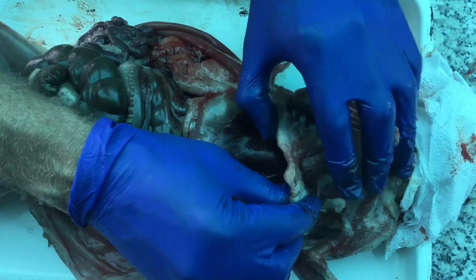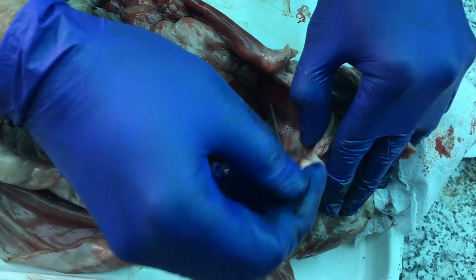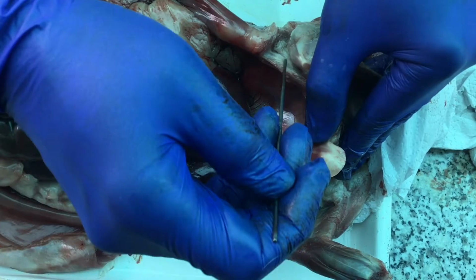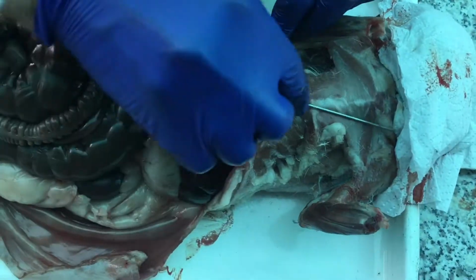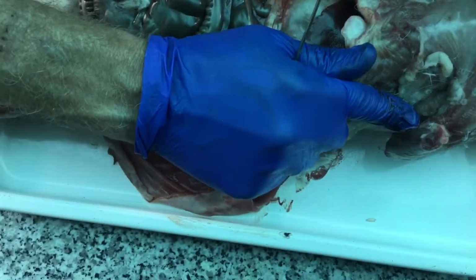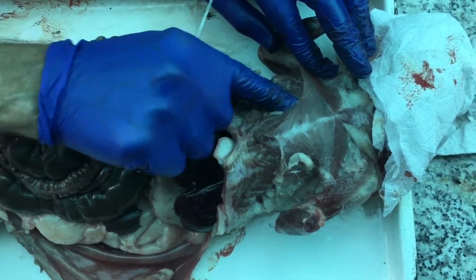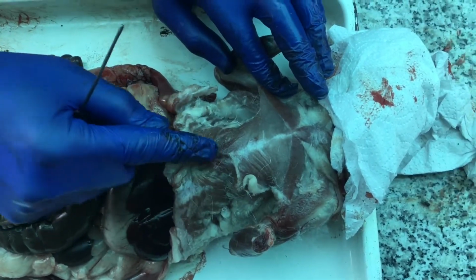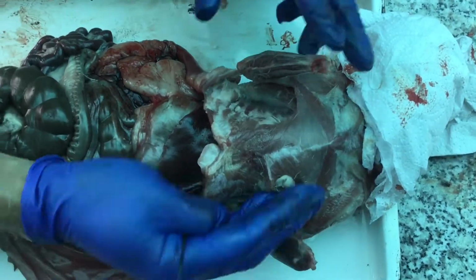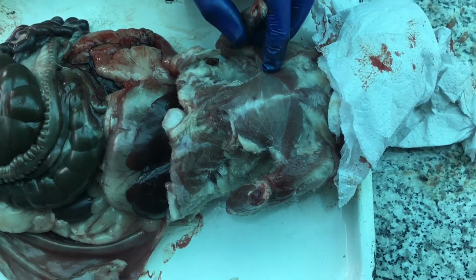And now what I want to remind you of is that right here at the cranial end of the abdominal cavity, you can see the diaphragm forming that seal around the inferior margin of the ribs, sealing off what's going to be the chest cavity. The chest region also has its outer tube with its bones. The skin has been removed, but the skin, muscle, and bones, now we do have bones, we have the ribs here, forming that outer tube, and we're going to continue our cut up into the chest region, opening up the coelom in the chest region.